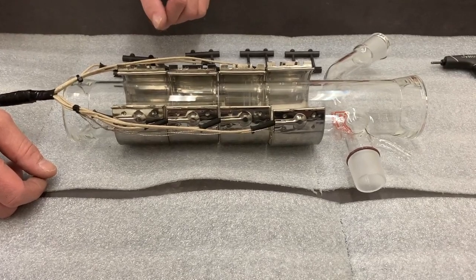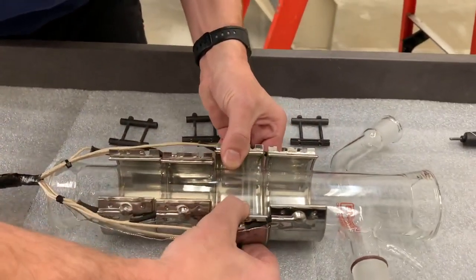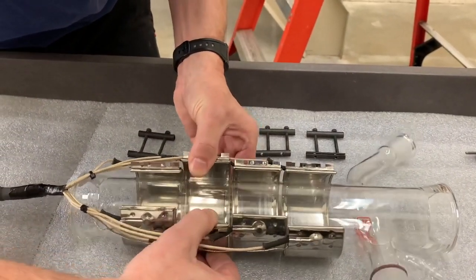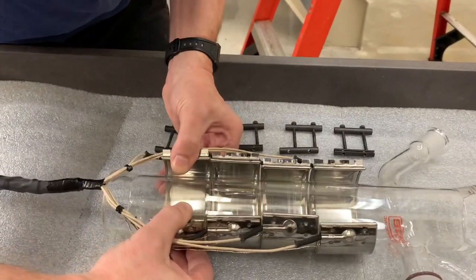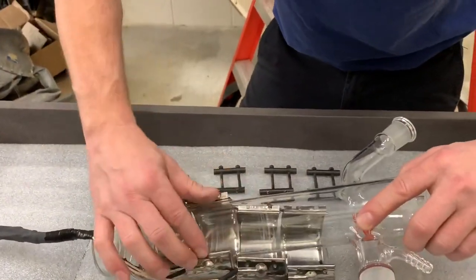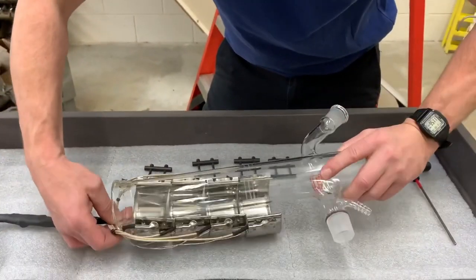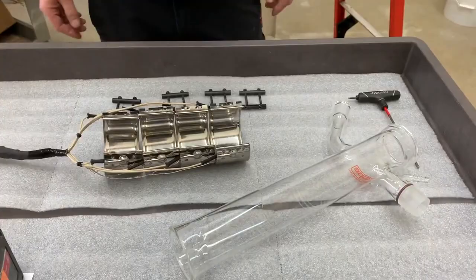Now that all the hardware is removed, Dave is going to loosen all of the bands, again being very careful not to crack that mica. Once those are loosened, we'll just pull out the glassware, which allows you to either ship it for repair, clean it, or do any other service that you might need to do on your system.